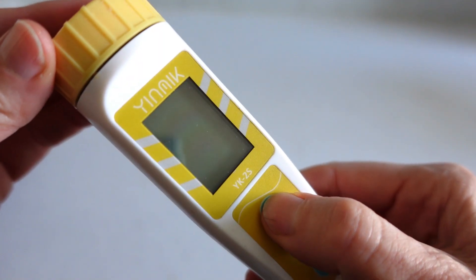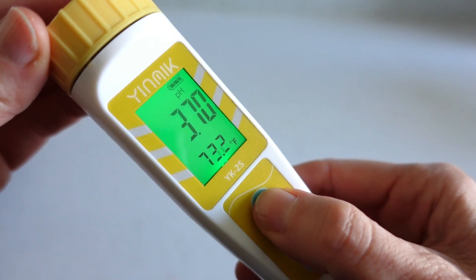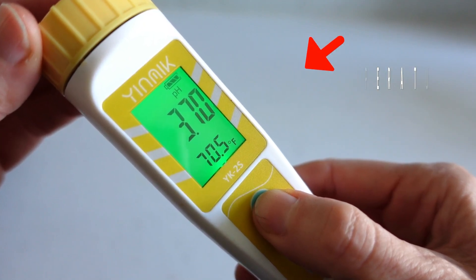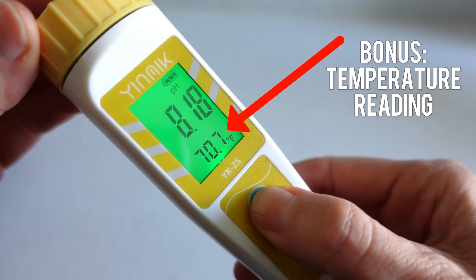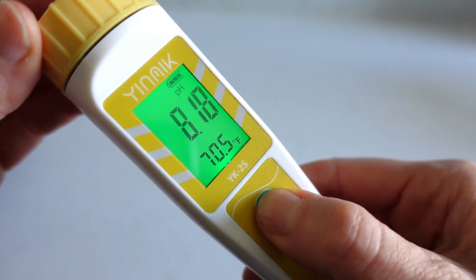The upgrade meter does have a digital display with a backlight for very easy reading. I don't have trouble reading the basic meter, but even so I really like the backlight — it makes the display noticeably easier to read.